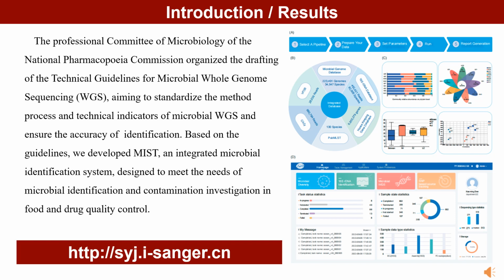MIST can analyze sequencing data in a variety of formats, such as FASTA, BCL, FASTQ, etc. It can be connected to a high-throughput sequencing instrument to acquire sequencing data directly. We also developed a publicly accessible web server for MIST.